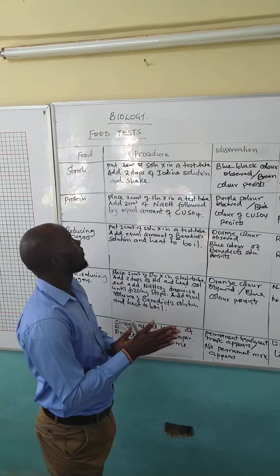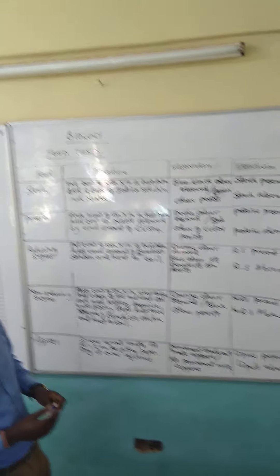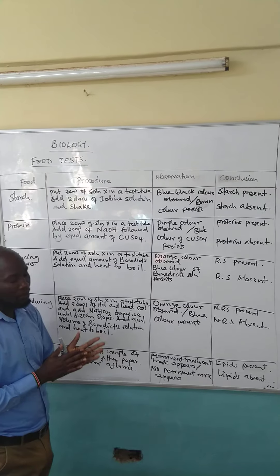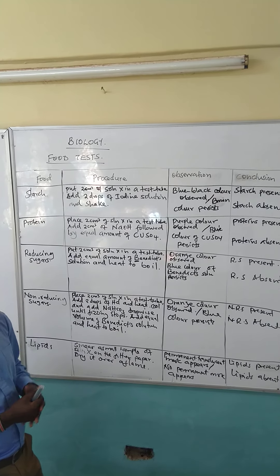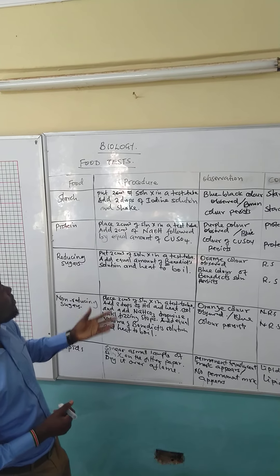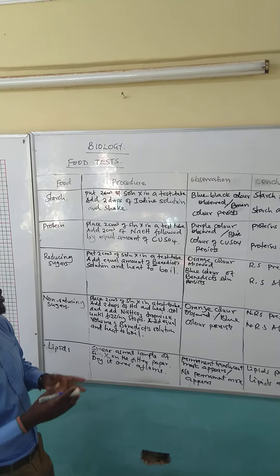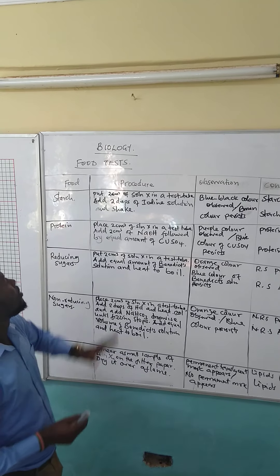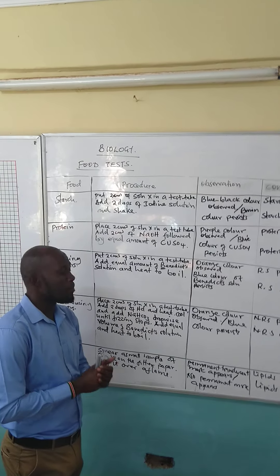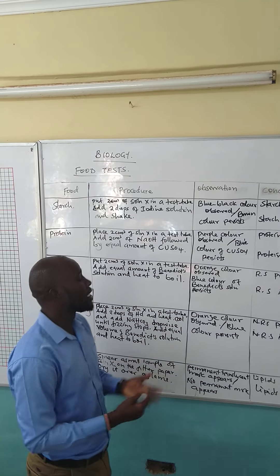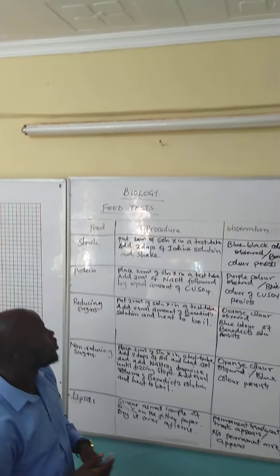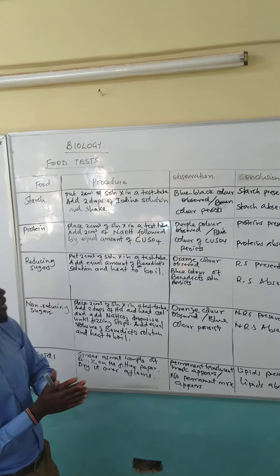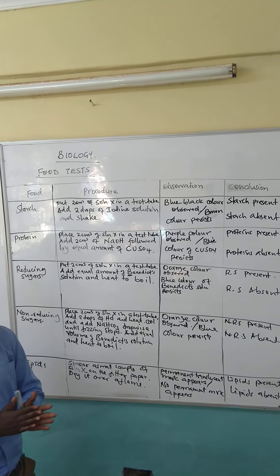Food tests is one of the parts of the biology practical where we do a lot of mistakes. When you are given different samples during the preparation, you can be given some reagents, and we know that each reagent is used for particular food substances to be tested. You can be given samples to mix in certain proportions to obtain solutions, and these solutions could be named as solution X, solution W, Q, or whichever letter is used. When given that, we are always supposed to use the solution that we have been provided with.